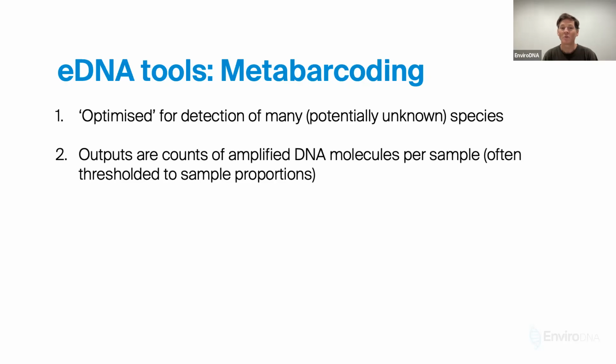And then, for reasons which many researchers have gone into in depth, and essentially due to the bias in PCR amplification, there is not linear exponential amplification of all molecules in there. A more commonly encountered and more robust metric is the proportions of reads for a given sample, which makes it a bit more comparable across samples. Although, of course, the absolute counts have some useful information.